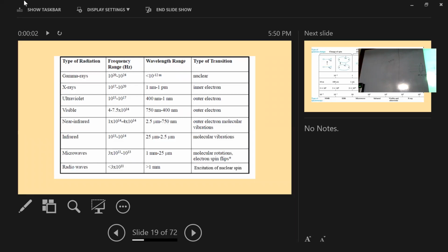So first we have excited from here to here, or from here to here, with the X-ray. So it will come back to the ground state once more, and when it comes back to the ground state, it will release some energy as radiation, and the detector system or the instrument will collect that radiation or emission. So that will correspond to the structure of the molecule, what molecule we are analyzing.